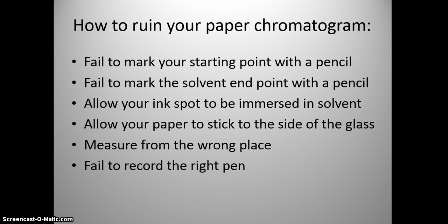If you measure from the wrong place in the end, be sure you're measuring every time from that pencil line you drew. Or if you just fail to record the right pen and get those mixed up, then if you didn't write it down initially on the paper and you go back later and try to remember, there's a very good chance you'll mess that up. So be sure you follow the lab procedure exactly.